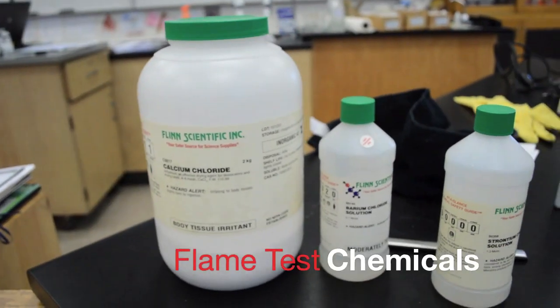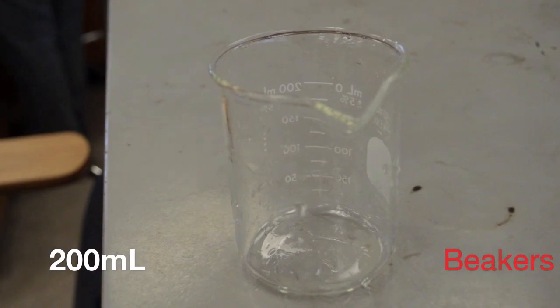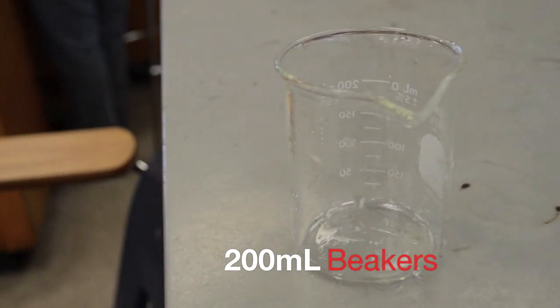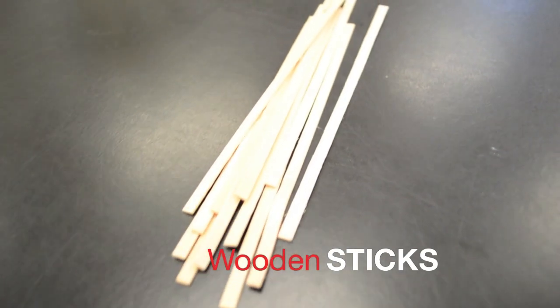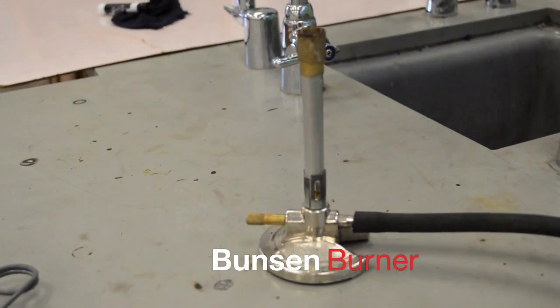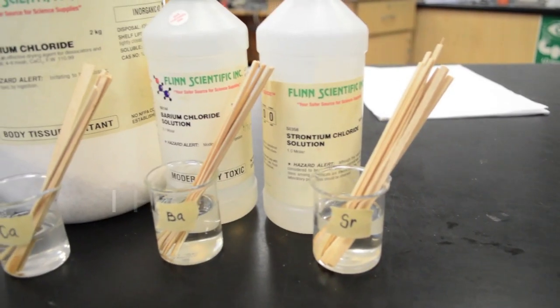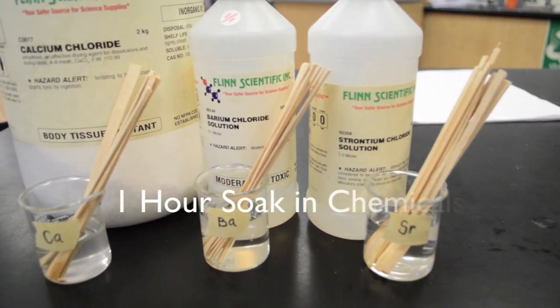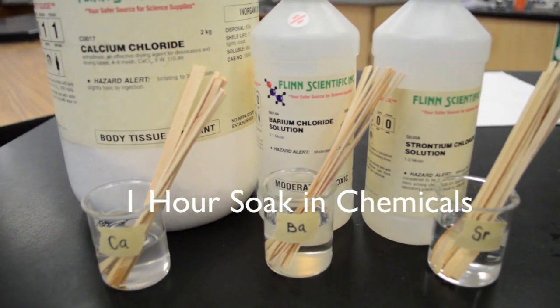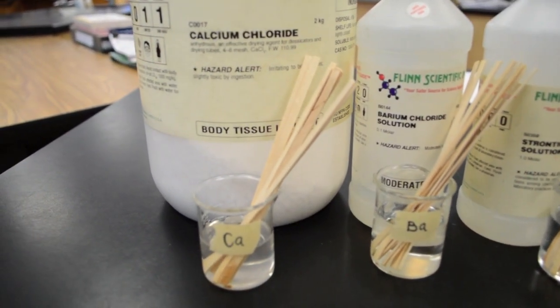The materials that we will use for the flame tests are the flame test chemical solutions, three 200 milliliter beakers, wooden sticks for soaking into the solutions, a Bunsen burner, and a flint lighter. To prepare for the flame tests, we soak the wooden sticks in the chemical solutions for about an hour so that the metal ions absorb into the wooden sticks.